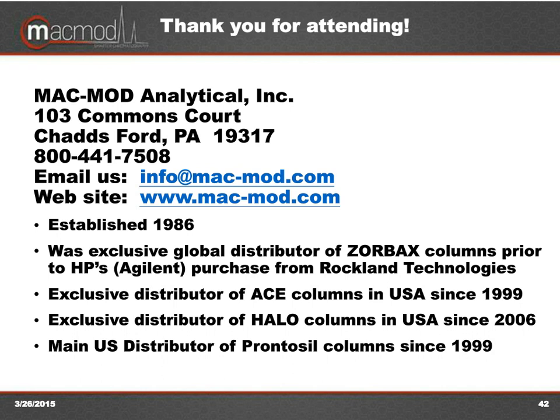There has been some talk in the past that operating at very high pH, maybe it's worse with phosphate and carbonate buffers, you can start to slightly cloud your quartz flow cells, but I have not seen that or attempted to measure that.